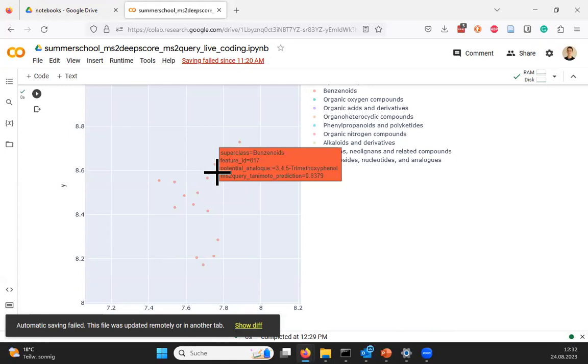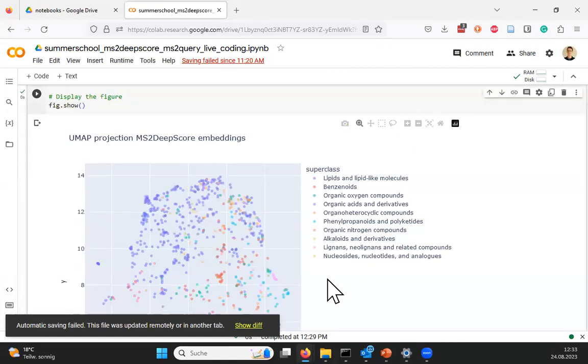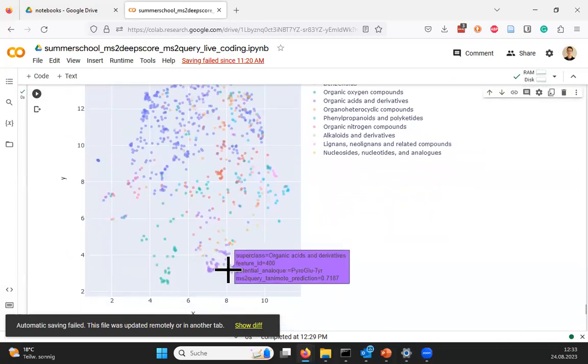I think that if you have any of this information, that would be useful, because what we do here is kind of walking blindfolded a bit, right? We have no clue if these predictions are right. So this is really only to get a first impression of, okay, there seem to be certain patterns. We seem to have many hits for certain compounds, but before you call it anything close to an annotation, you have to do a lot of first steps.